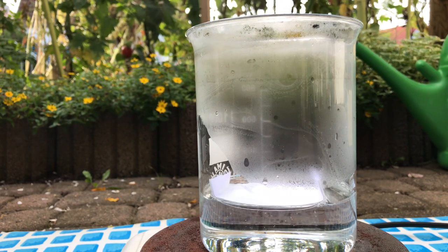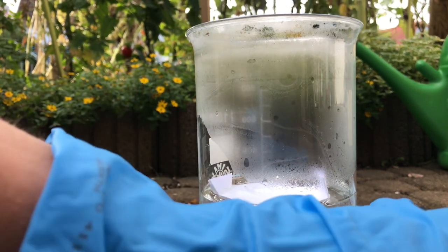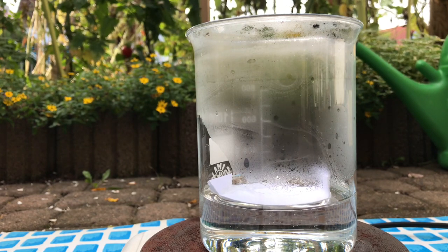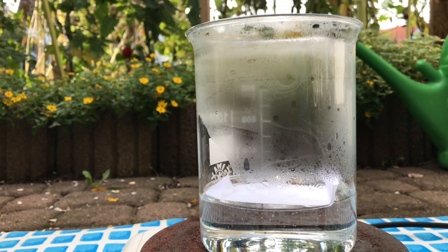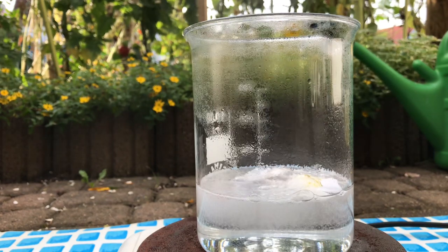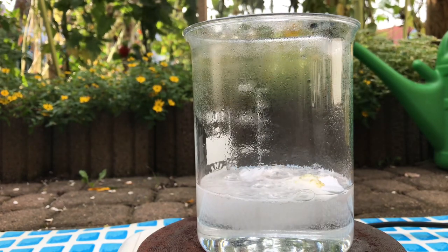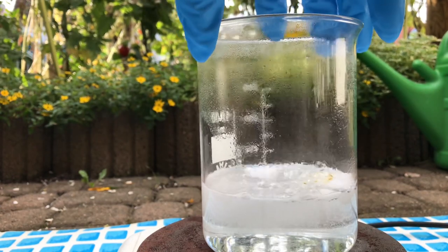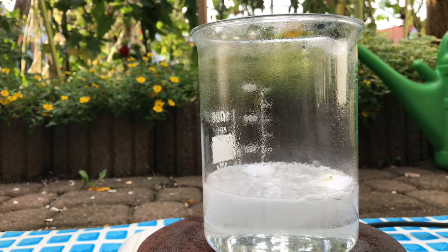It immediately starts to bubble a lot. But it's not enough — let me heat that up. It was actually the case that we hadn't added enough sulfuric acid, and now that problem has been fixed. The paper immediately starts to dissolve leaving no residue behind.